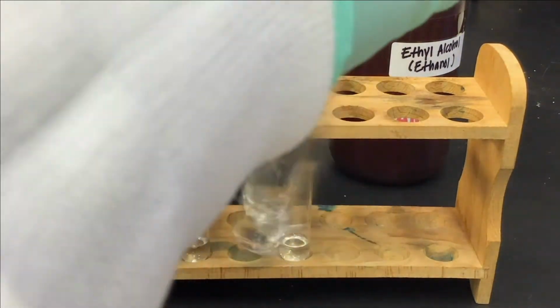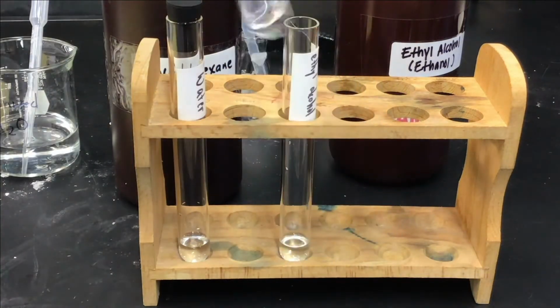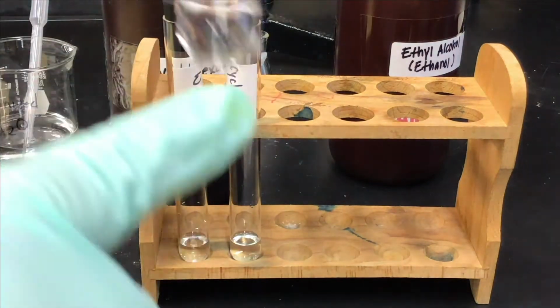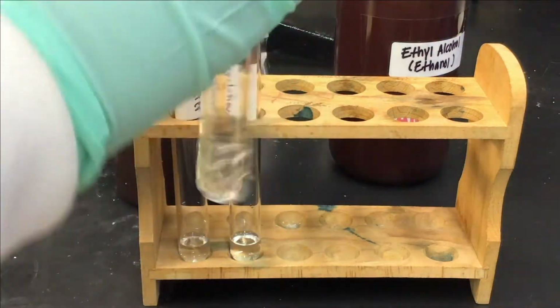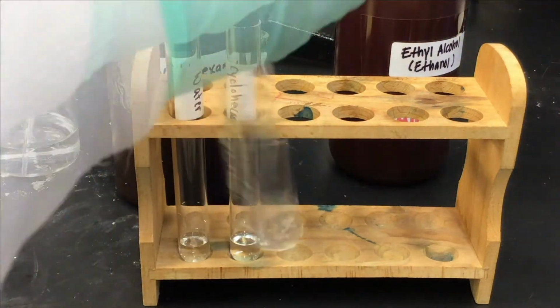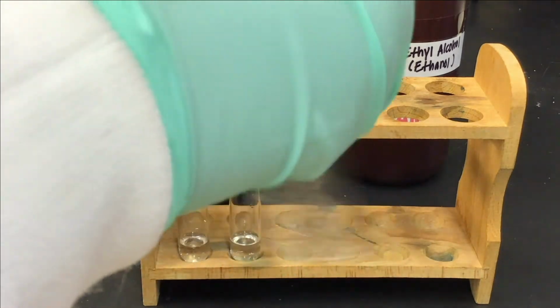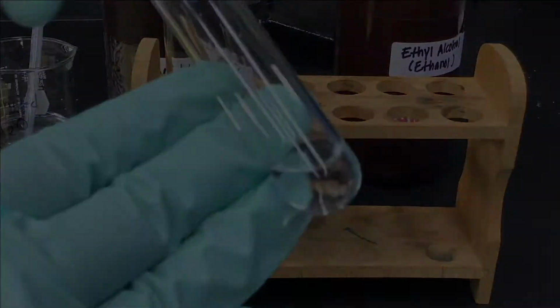After shaking our cyclohexane and unknown test tube, we see that all our crystals have fully disappeared. After shaking the test tube that has ethyl alcohol and our unknown, we again see no crystals.